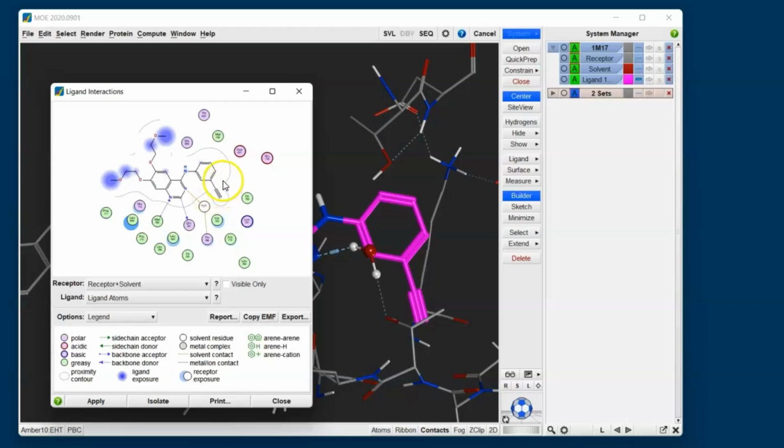But as we move around the dotted line, looking at the rest of the binding pocket, we see a bit of space around this ring system, suggesting we might be able to fit a substitution in around this region. And in fact, the dotted line becomes broken as we head out towards the mouth of the pocket where the ligand is exposed to solvent. Given that we have no specific interactions on these polyether chains, perhaps this could be an area to improve our ligand design.